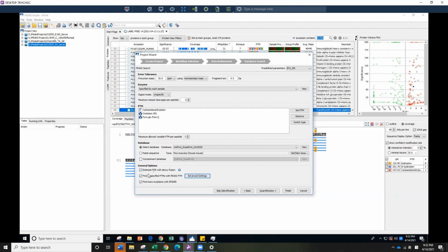And then make sure you have decoy and PTM and Spider set up for you, and that will do. In another video, I'm going to explain each of them in more detail. But selecting BYUMS is the first thing you want to do if you are doing a standard run, and that will make your life a lot easier because you can just change your organism.